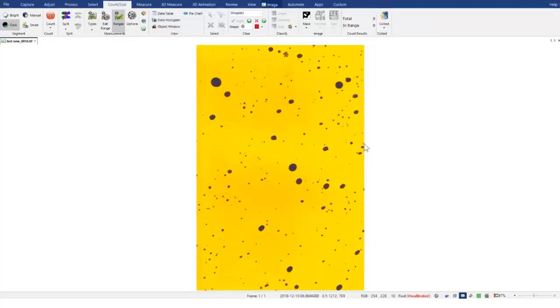If you're doing some other type of spraying operation, this is a way of looking at how well the distribution is occurring, or how well the dispersal of any type of agricultural product is being spread. Again, this is used in a lot of other fashions. There are also food gums that can be used when you use this wetting paper. They use it in quite a number of different scenarios. But the idea is I want to count the drops.